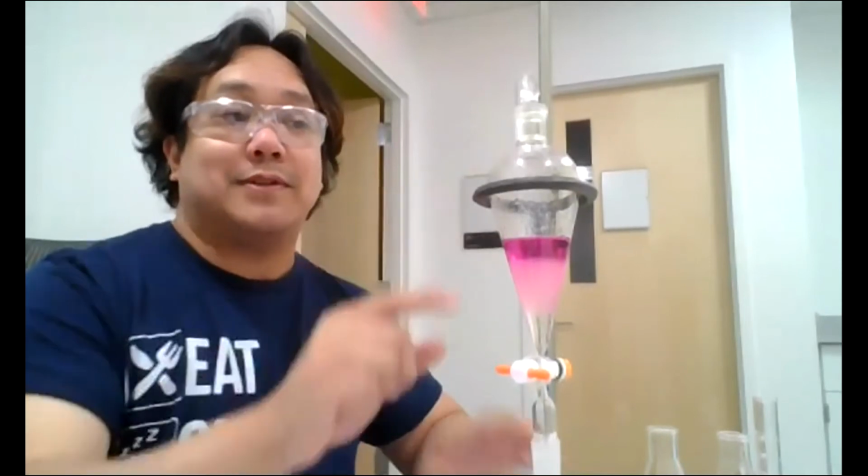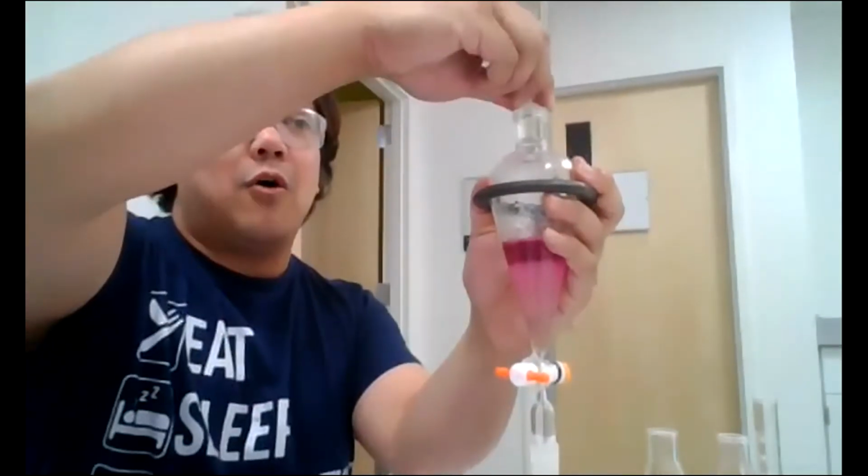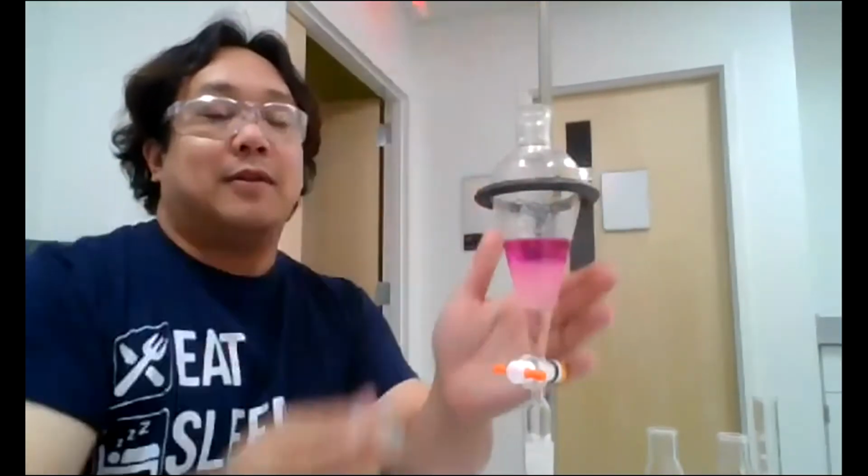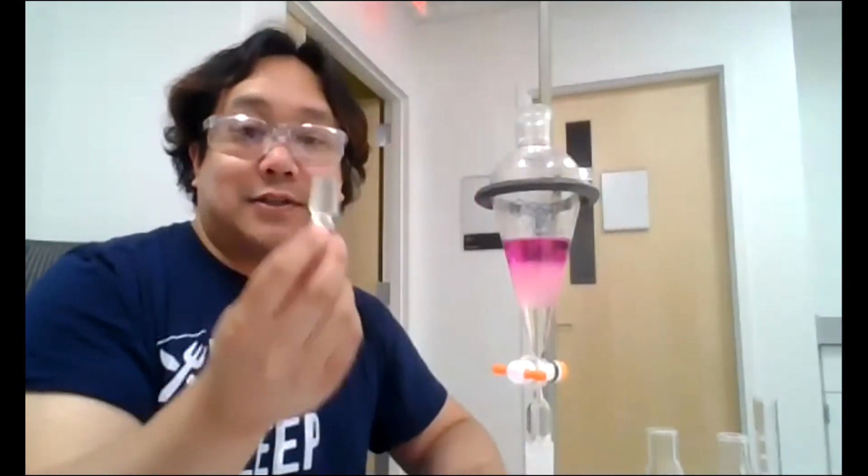If your partner did exactly what I did, what should you be telling your partner right about now? You should be telling your partner, we're going to get point deductions because the stopper is still in the separatory funnel. Always, see, it was stuck a little bit. Always let the separatory funnel rest unstoppered.